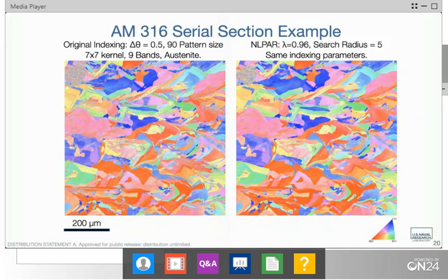So let's see here. Somebody is saying that they are looking at an AM alloy, but there's some black area. We're not able to identify it. I have no idea. I can't help you with that. I'm sorry. Certainly we see black areas from pores and those types of things. It may be that you're having some kind of phase transformation, might be ferrite that's occurring. Oh, this is maybe an aluminum alloy. Yeah, I'm not sure. I would not have any insight on that. All right.